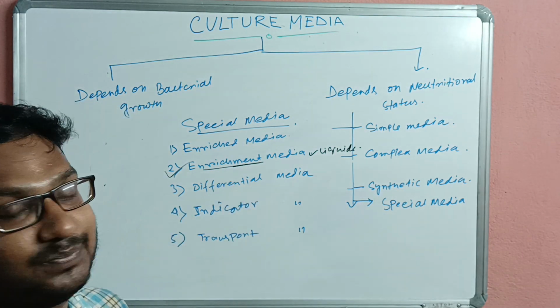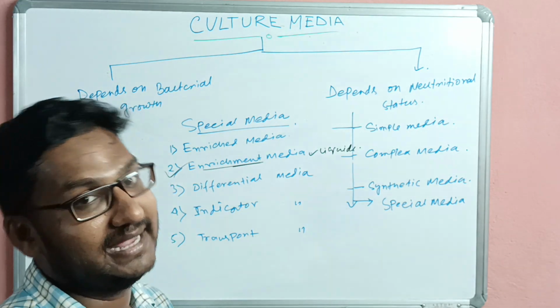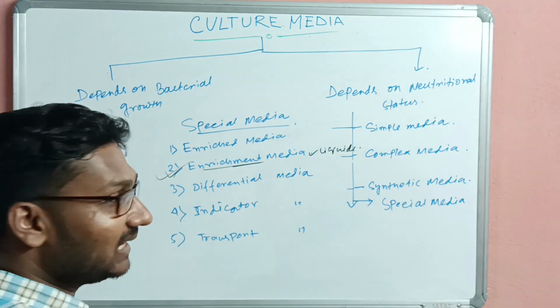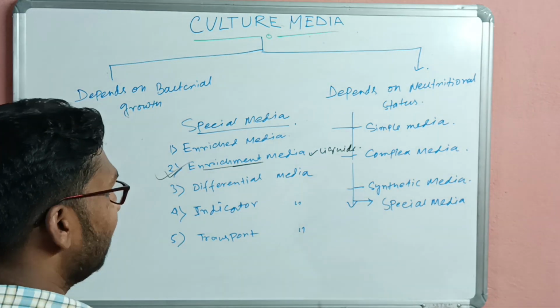This is called the enrichment media, and it should always be a liquid media. Clear? Like selenite F broth, alkaline peptone water.